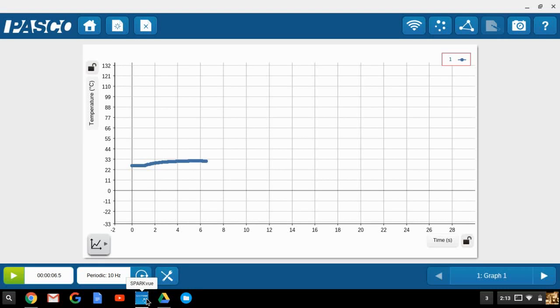This is a video showing how to export the journal from SparkView. I've previously collected some data. Prior to collecting my snapshot, I want to display the data in a manner that is going to give the most information.